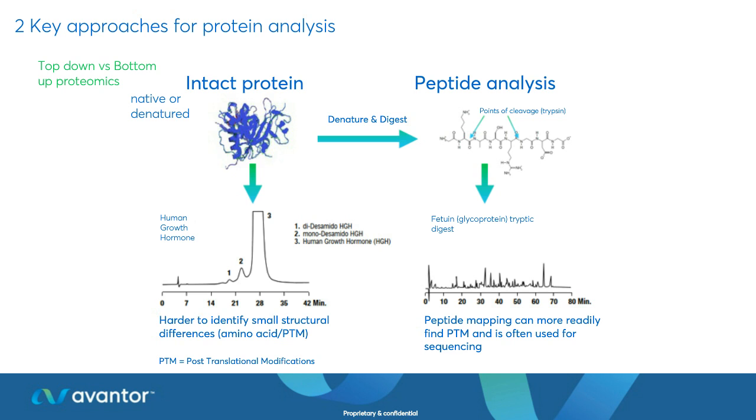And you can then also compare those with the originated drug, the originator protein, to see where it differs in the amino acid sequence. So it's a nice way of comparison to the original protein. And there's lots of databases now available that show peptides as well as some of the other things we're going to look at later on, like the modifications.